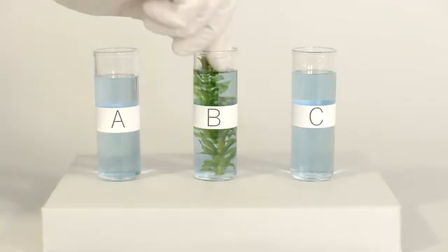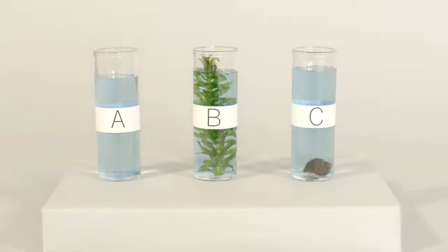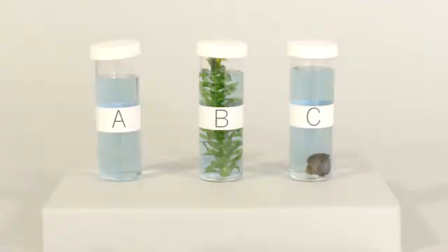Next we'll add an Elodia plant to vial B and a freshwater snail to vial C. Vial A, with no organism, will be the control group.